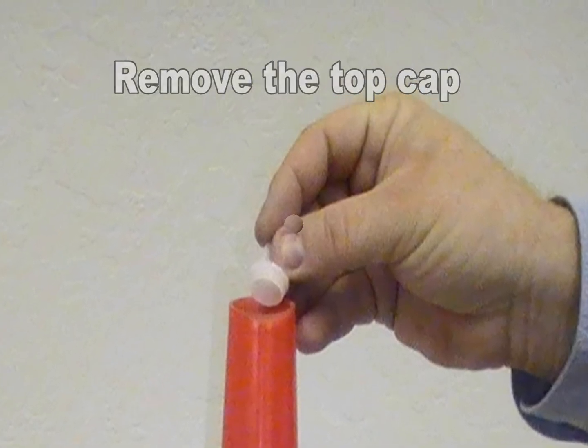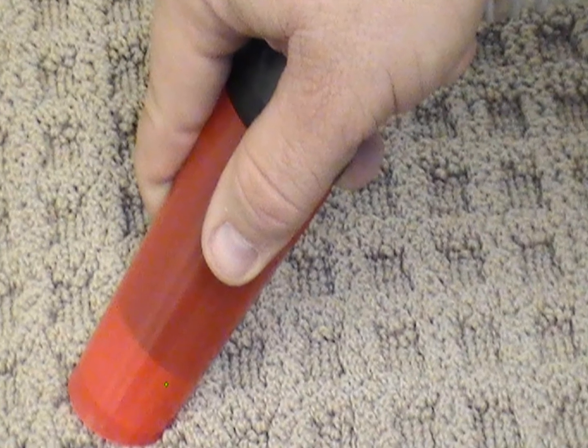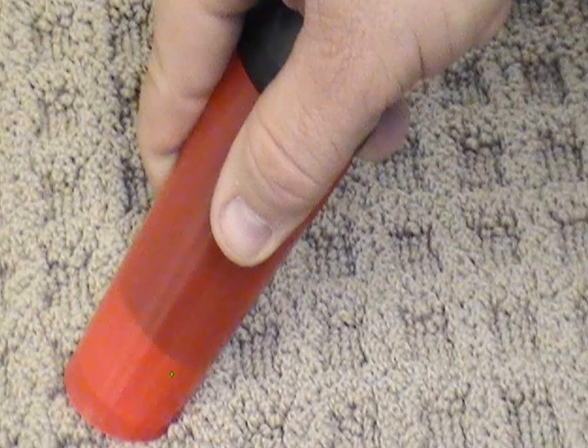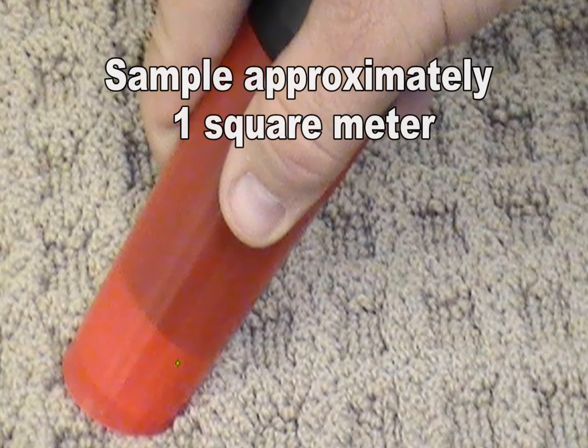Then remove the top cap. Turn on the vacuum and begin collecting samples from four separate areas for 30 seconds each. Each area should be about a quarter of a square meter. The total sampling time is two minutes and the total area sampled is approximately one square meter.